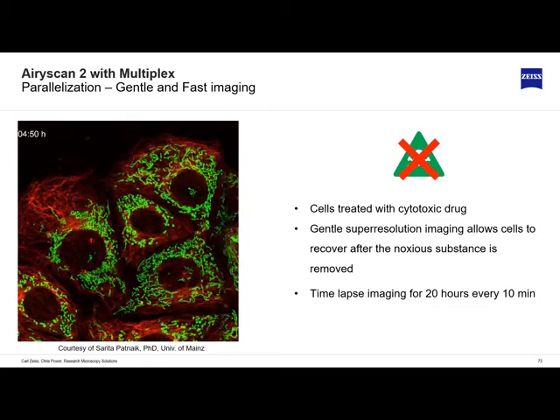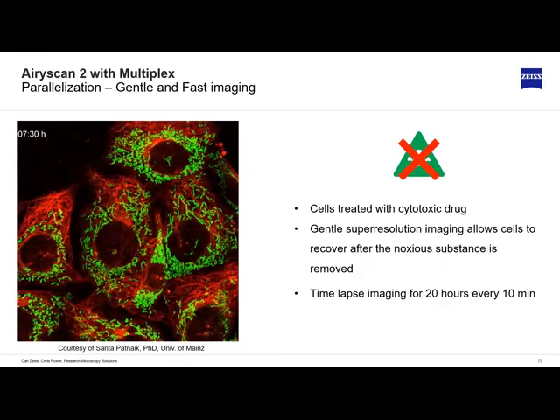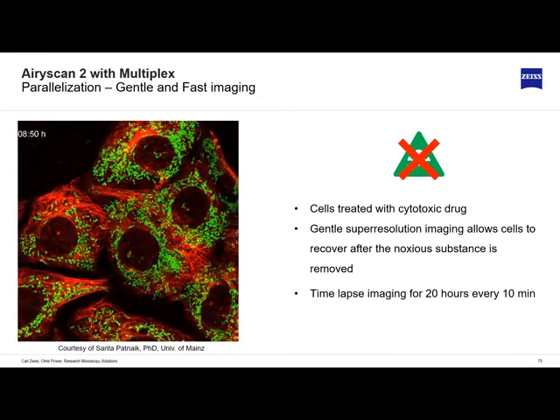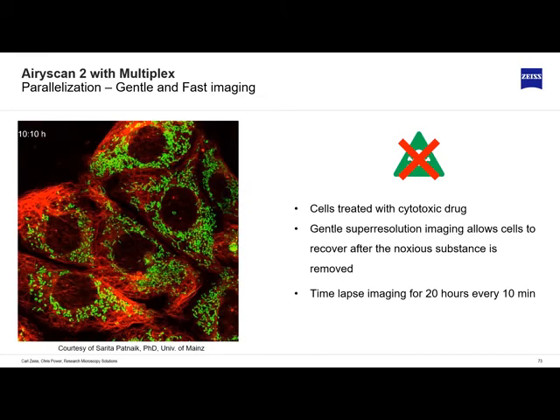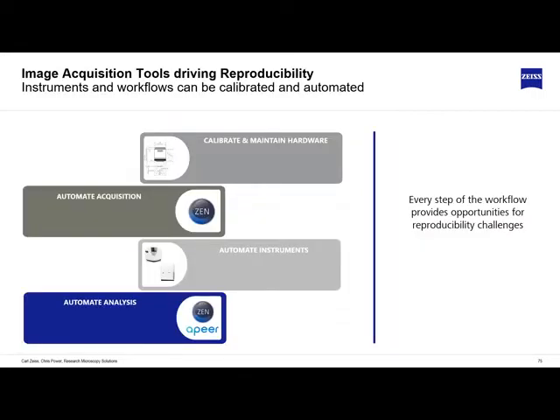So up to now, we have confocals. They're very, very powerful. They've got better and better with performance over time. So happy days, everything is nice until the systems become so complicated, you can't always necessarily replicate your experiments. So in the last part of the talk, I'm just going to talk about reproducibility in LSM. So Nature's been highlighting it can be very hard to reproduce your experiments, not just other people's, even your own experiments here. So we want to try and help people do that.